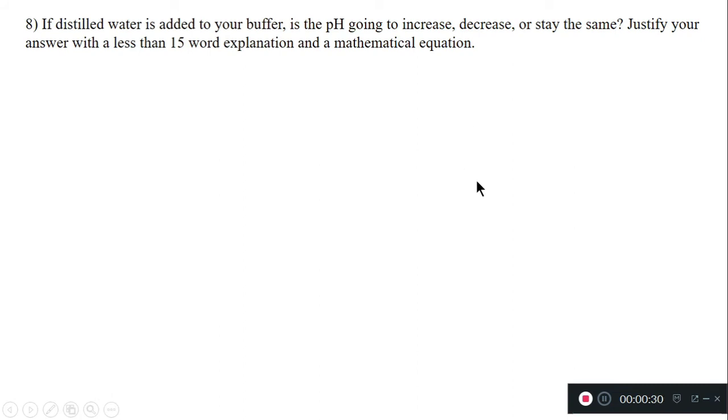So what equation would be the right equation? Well, let's use the Henderson-Hasselbalch equation. And let's think about what's going to happen. So my conjugate base, I started with 0.5 molar, but then when I mixed it in ratio of 18 to 100, I diluted it. Same thing with my acid, I started with 0.4 molar. So this is referring to the concentrations after I diluted it by mixing.